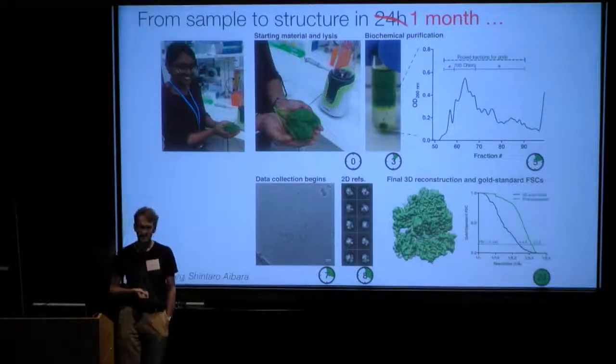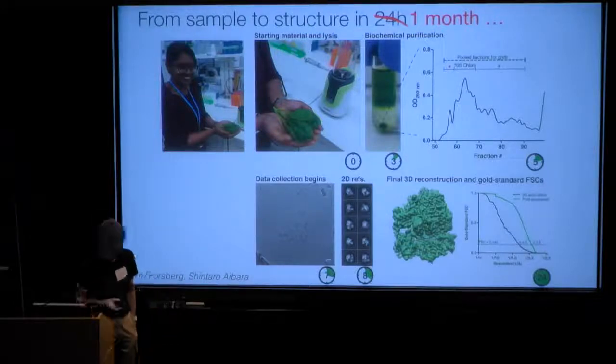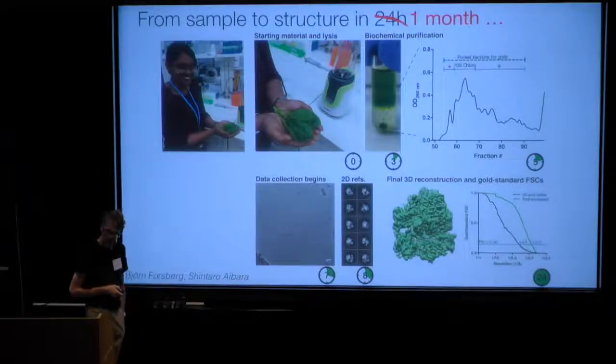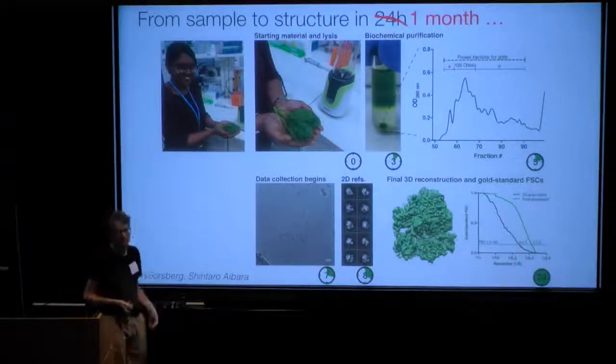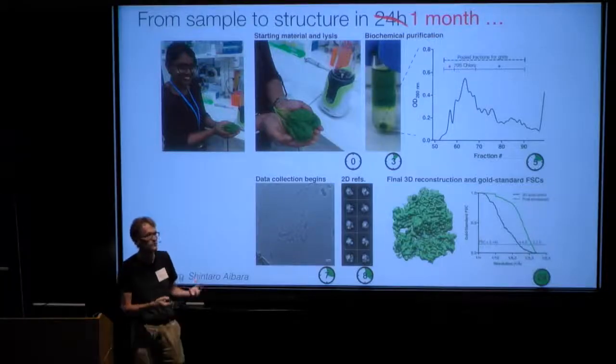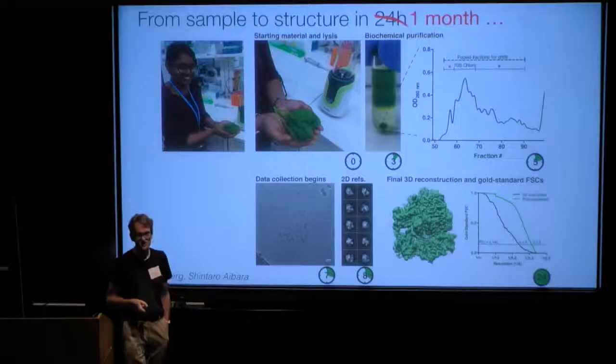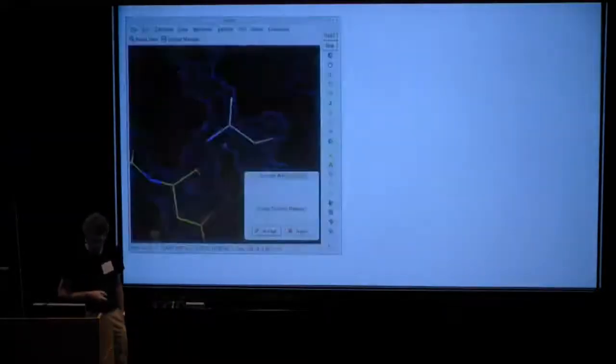And at least for us, this is frequently becoming the largest bottleneck. How do you move actual structures, create actual structures into your maps rather than just getting the maps determined automatically? So for a long time, I've been, well, hey, I'm a physicist. I've been interested in the problem that can we actually optimize this part of the problem? And the other reason I'm interested in that is that we have a background working with molecular simulations. I really would love to be able to somehow derive proper restraints from the maps and add those as very weak restraints to bias my molecular simulations.